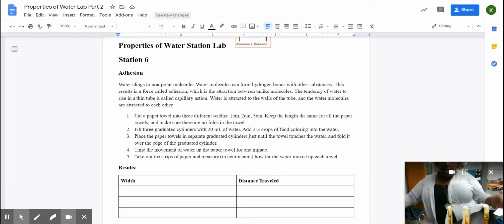All right, and I'm gonna time it for 1 minute. I'm gonna do it for a minute from when I put the last paper towel in.